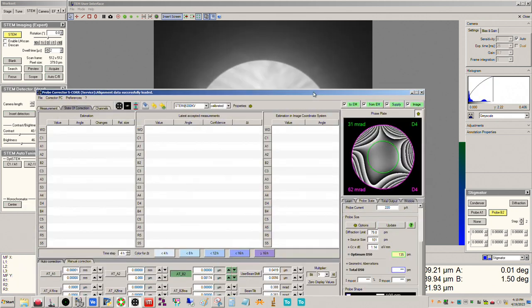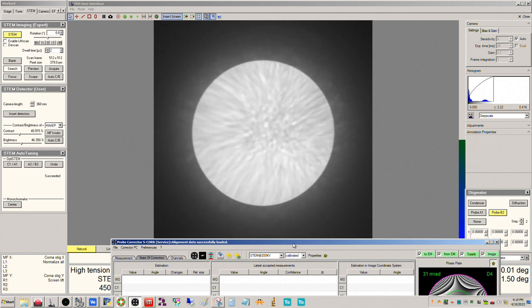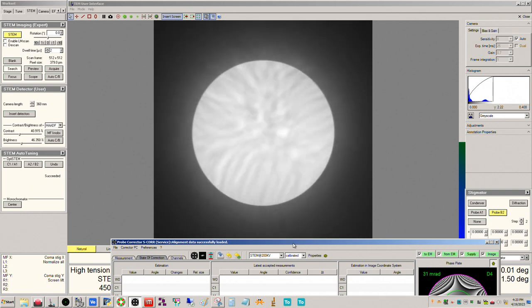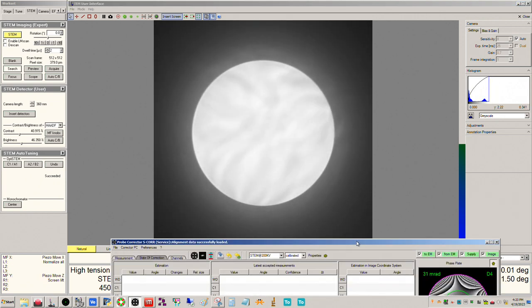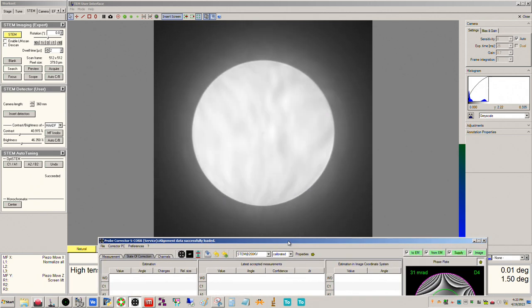Yeah, so there's still some B2 there. Okay. There we go. All right, and we got maybe a little still A1. So go ahead and fix that. Okay, that's as good as we're going to get this with coarse A1. So, all right, we're good to go there.